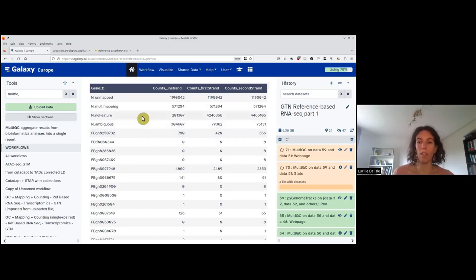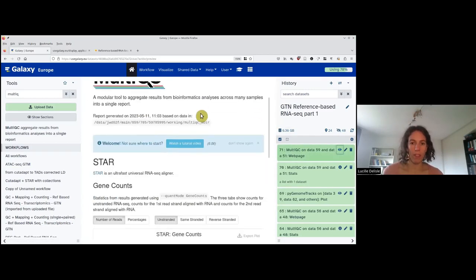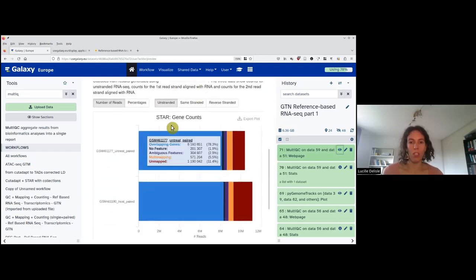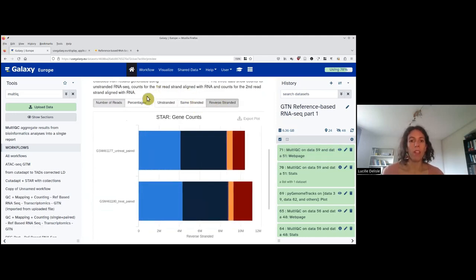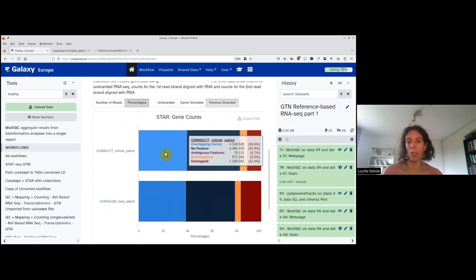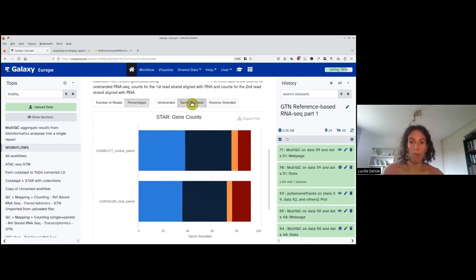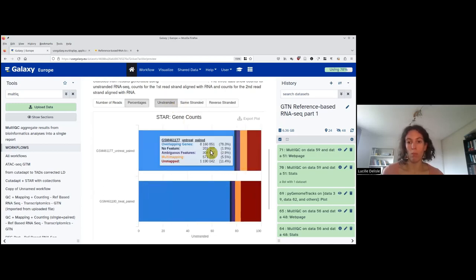MultiQC has finished. I click the eye icon on the web page. The summary shows gene counts for all three configurations: unstranded, same-stranded, and reverse-stranded. As percentages, the reverse-stranded and same-stranded both show about 40% of reads attributed to genes, while the unstranded configuration jumps to 78%. This also confirms that this is an unstranded library.